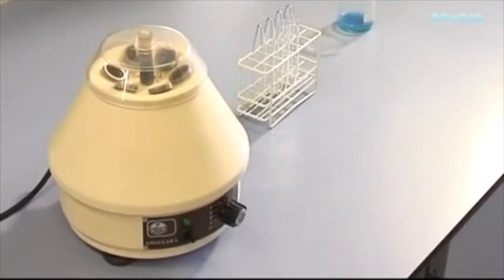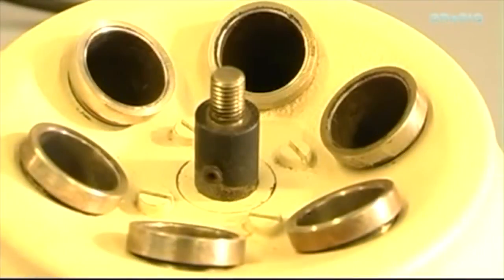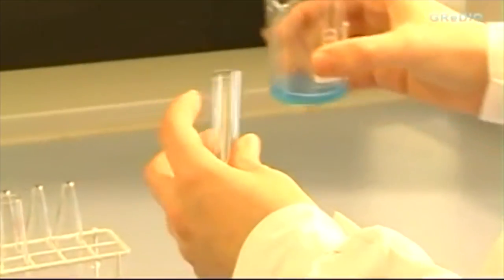The proteins of the blood remain in the supernatant liquid and require more centrifugal force and time to precipitate. Thus, higher revolutions are required along with an extended time to precipitate proteins from the blood and thus extract pure DNA.